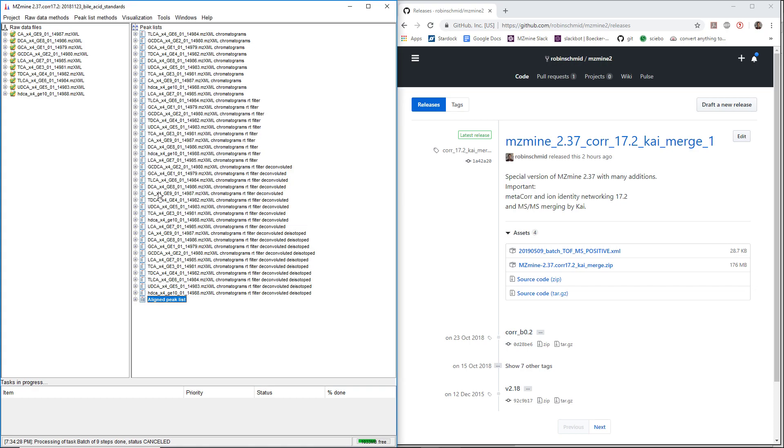These modules, we're going to run all of these modules in a batch, and this is going to happen in another video.